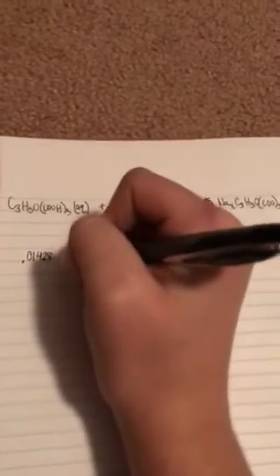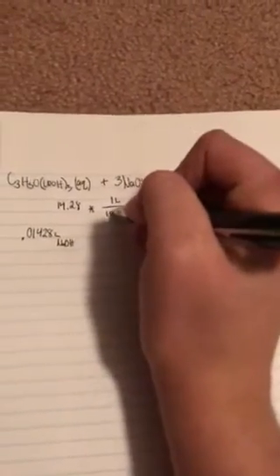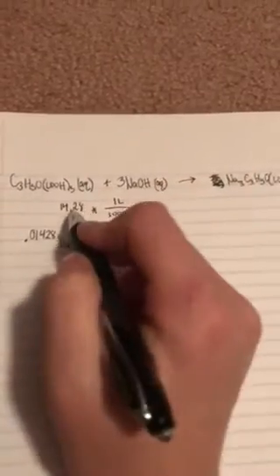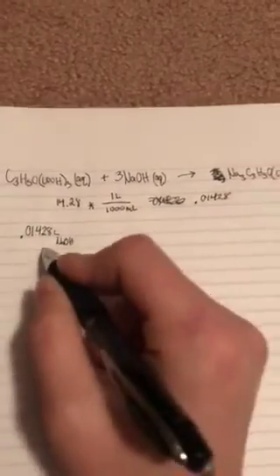From trial 1, which is where I'm going to do my experiment from, we had 14.28 milliliters of NaOH, and I'm going ahead and writing that in liters. This can be found by taking the 14.28 and multiplying it by 1 liter over 1,000 milliliters. Basically dividing this by 1,000 would give you 0.01428, which I found here.